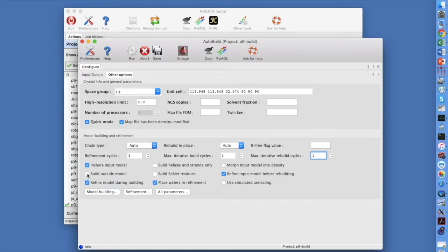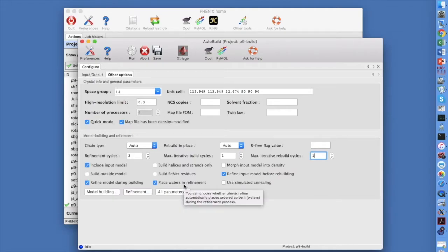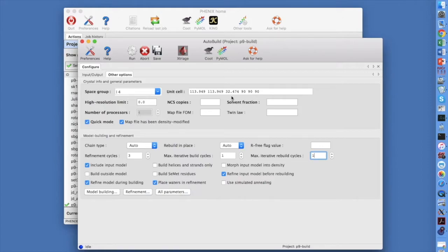Let's leave Place Waters in Refinement as true. These waters are both true waters and placeholders for something is present here that assist in refinement and model building.